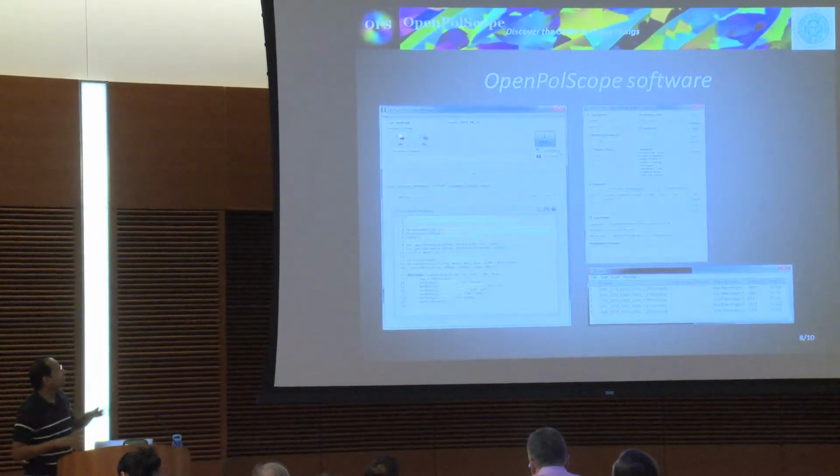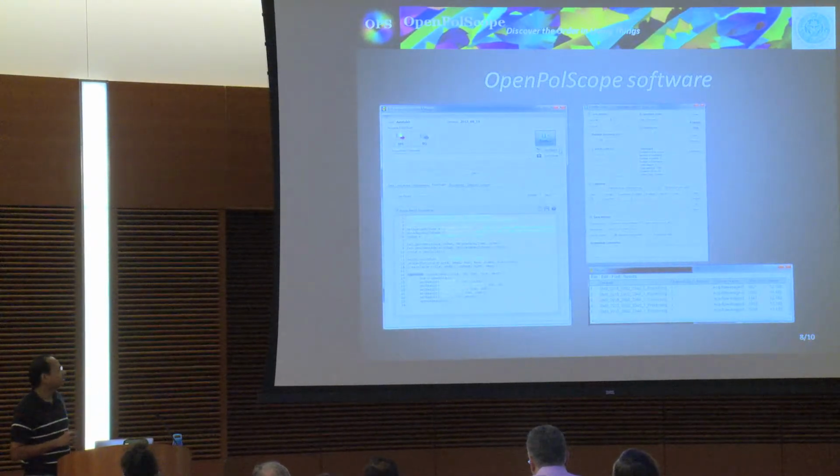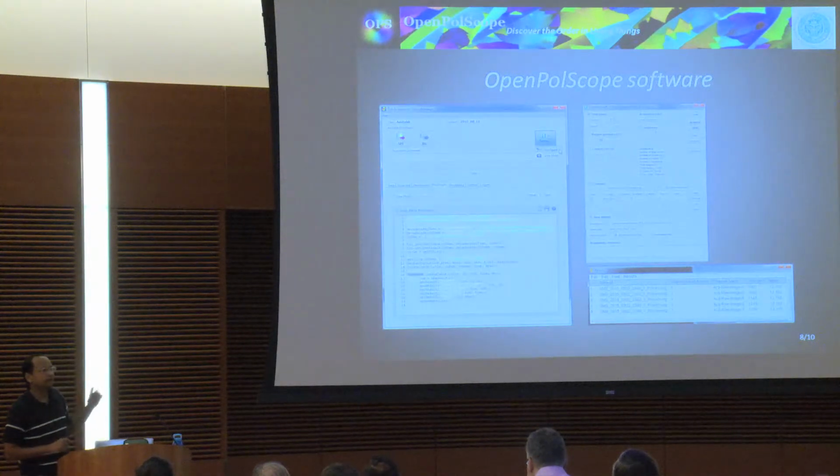This is another neat mode plugin which says, I don't need a device, I'm just a macro processor. Any image stream that is coming through, I will do some processing on it. In this case, we are using macro extensions to get into the Micro-Manager metadata information and put it out. You can probably do some kind of intelligent acquisition based on that: just script it and have your acquisition run based on that.